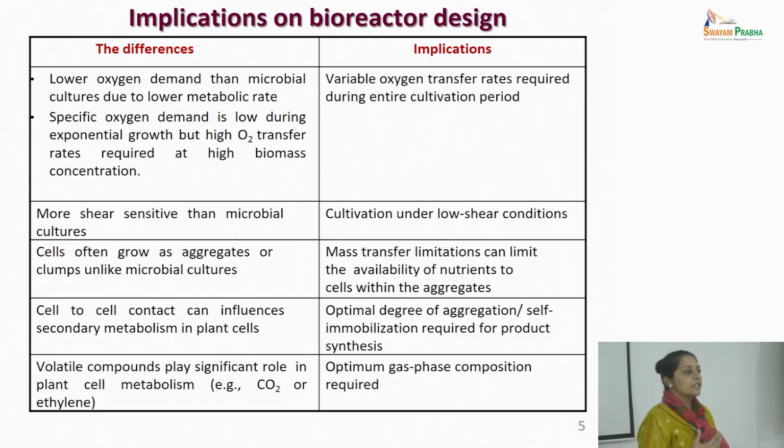What we observed was that despite all the optimization at the reactor level, with such high cell densities, we were at around 900 grams of fresh weight in nearly 2.4 liters of medium. By the end, the cells had settled at the bottom of the reactor. The mathematical model predicted that we would reach 39 grams per liter, but what was the assumption there? We did not take into account the non-Newtonian behavior, so viscosity for us was the same.